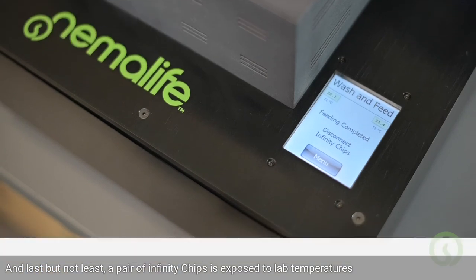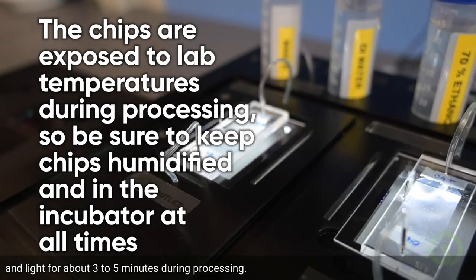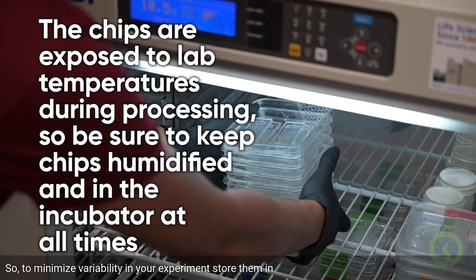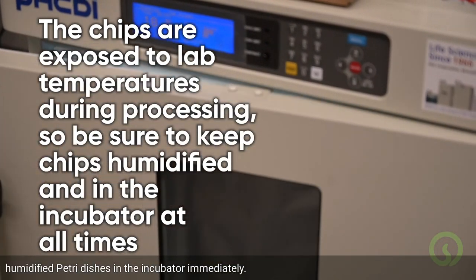Last but not least, a pair of Infinity chips is exposed to lab temperatures and light for about 3–5 minutes during processing. So to minimize variability in your experiment, store them in humidified Petri dishes in the incubator immediately.